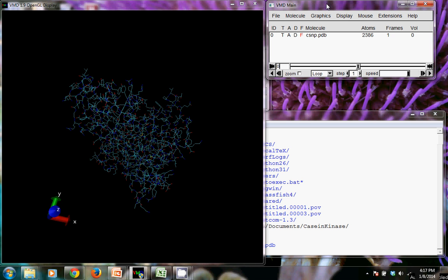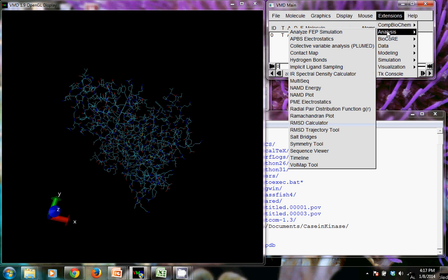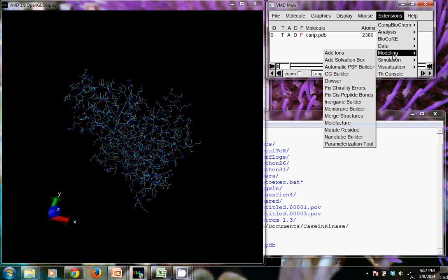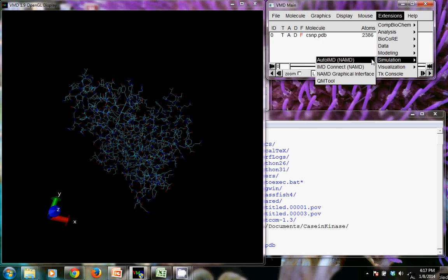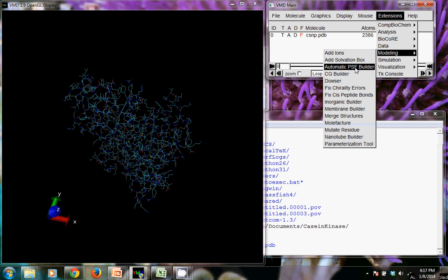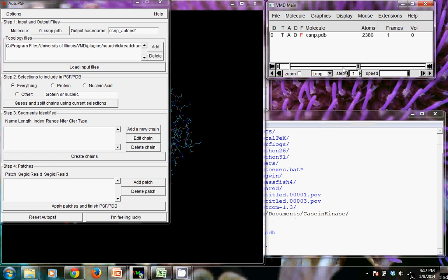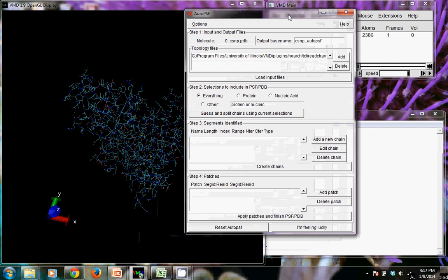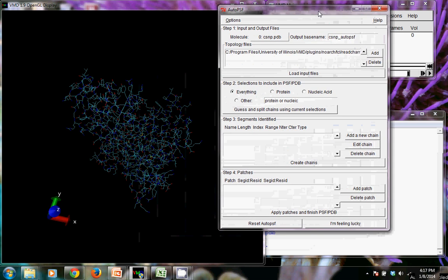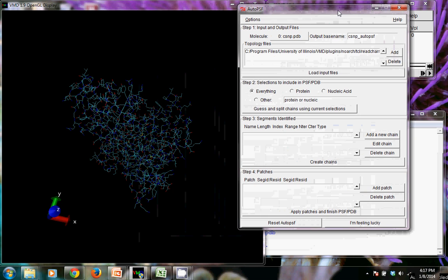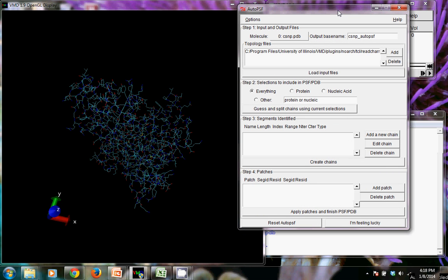So I'm going to open the built-in protein structure file builder. It's pretty good at guessing if you only have one structure open that you want to use that structure. If not, you may need to change that here where it says molecule. I'm going to change the output base name to just CSN.